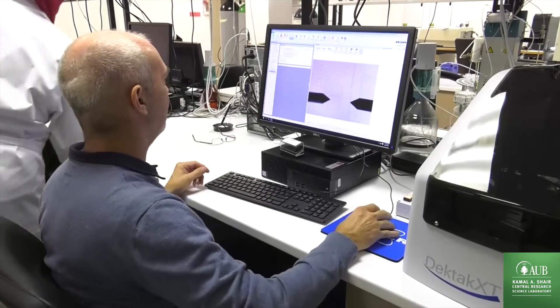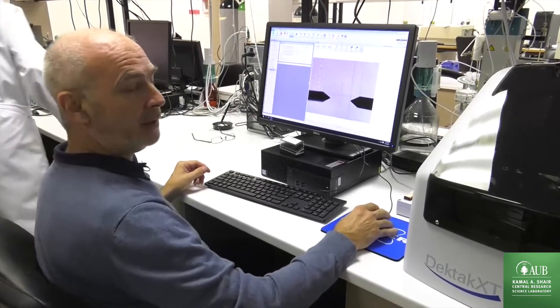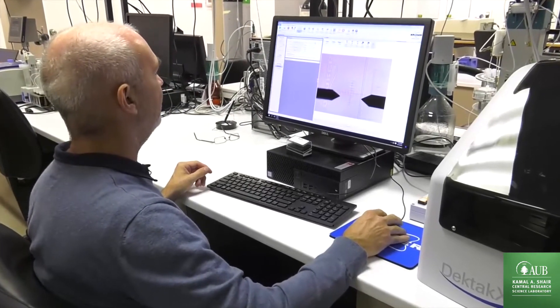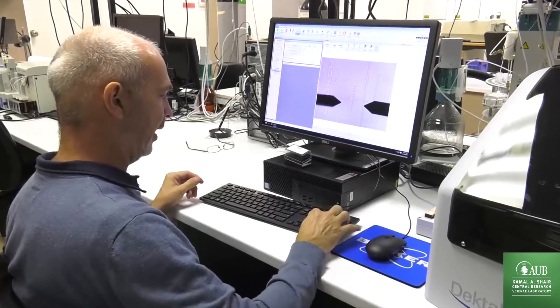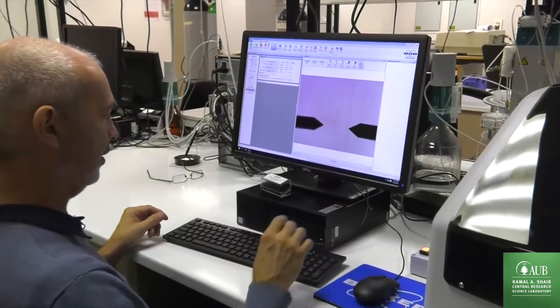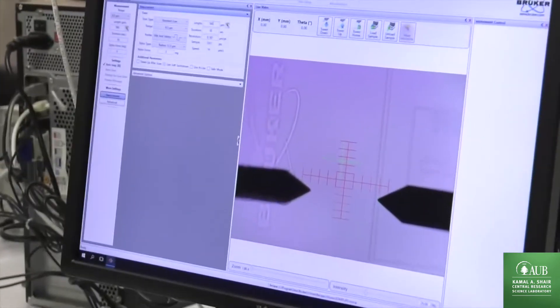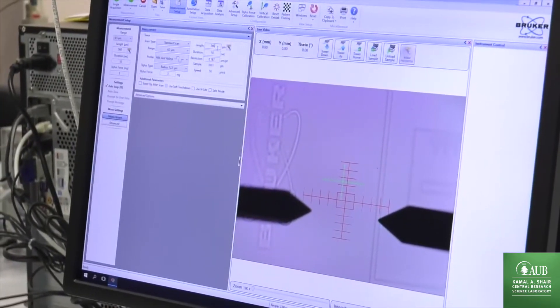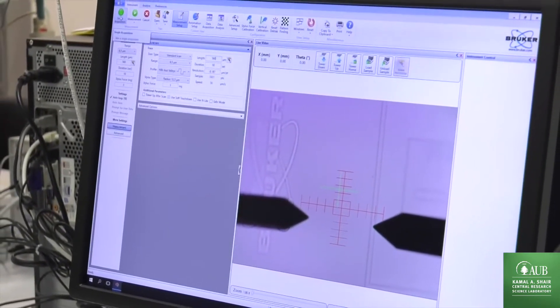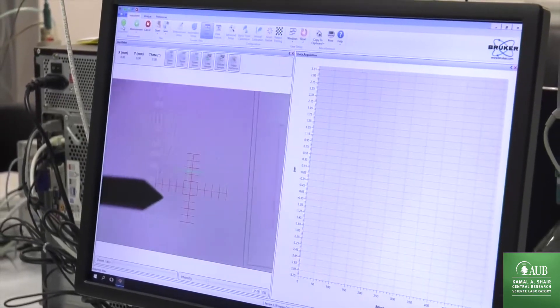So to measure the roughness, we again select the smallest scan range. And we select a scan length. Now anticipating that the roughness will be very low, I set it to 560 micrometer and take a measurement.